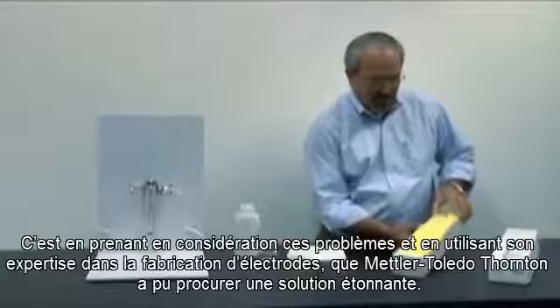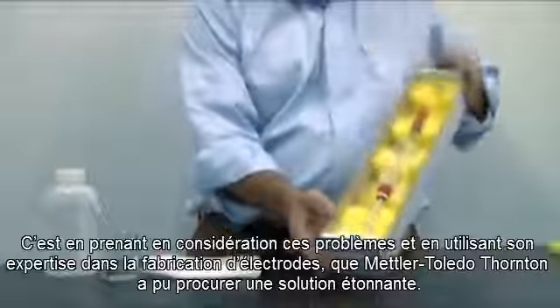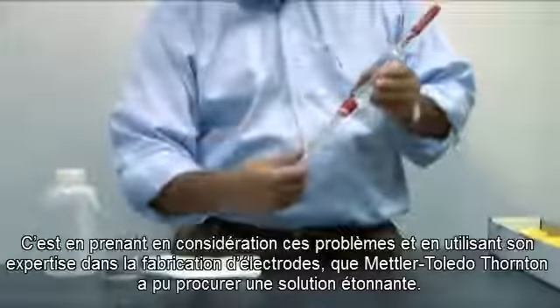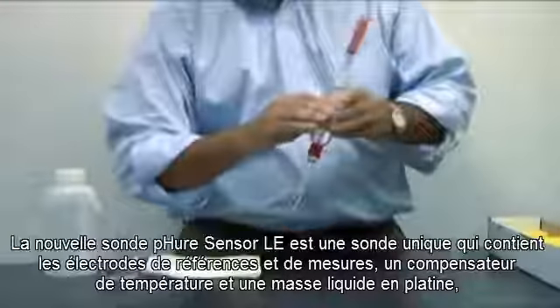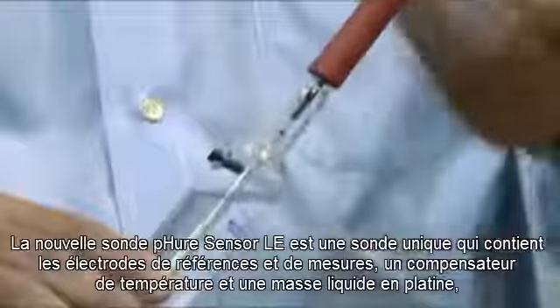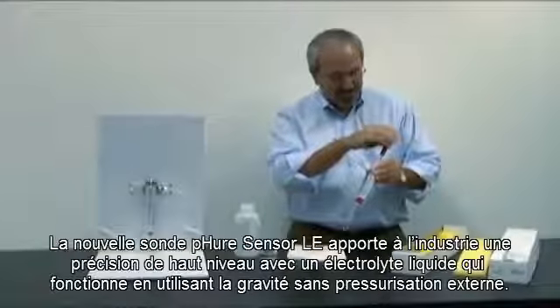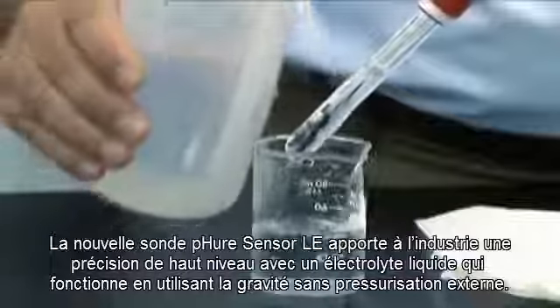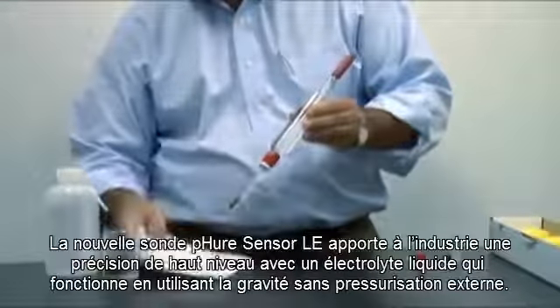Considering these problems, Mettler Toledo Thornton has utilized their expertise in electrode manufacturing to deliver an amazing solution. The new PureSensor LE is a single probe that includes measuring and reference electrodes, a temperature compensator, and a platinum solution ground, which can also provide an ORP measurement. The new PureSensor LE provides industry-leading accuracy with a free-flowing liquid electrolyte that operates using gravity without external pressurization.